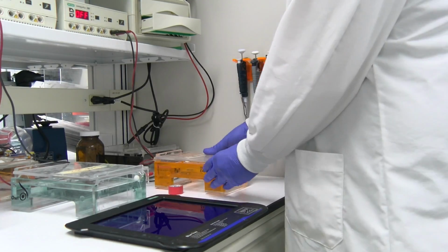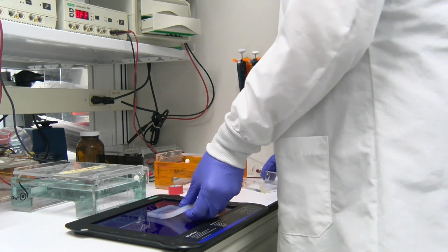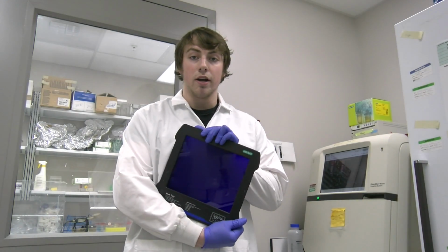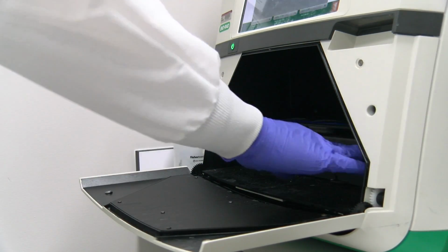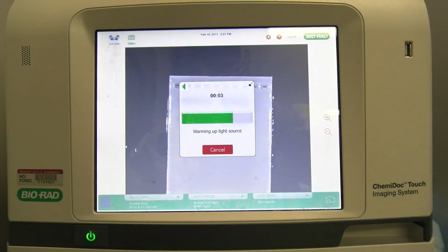Now that our gel is done running, we can use the ChemiDoc machine to verify the success of our PCR reactions. For imaging nucleic acids, we will use this blue tray. This machine uses UV light, which we can use to illuminate the different DNA bands and then compare them to the ladder. When we can compare it to the ladder, we can see the true size of the DNA band and see if it's the one that we desire.